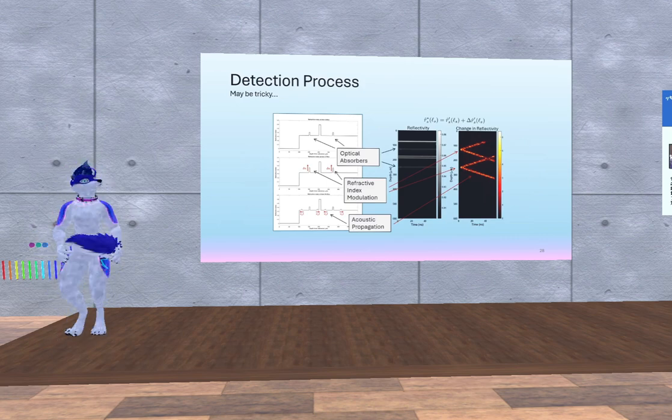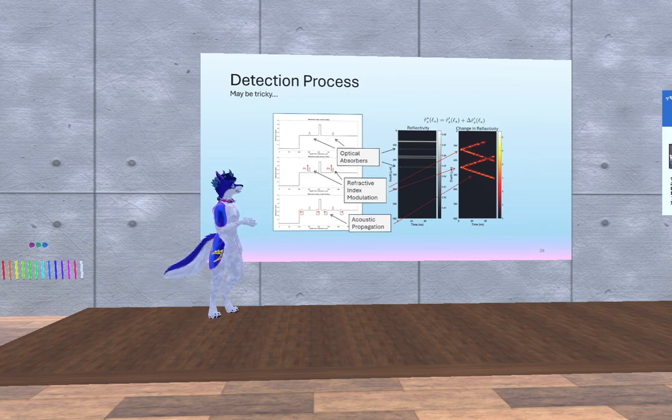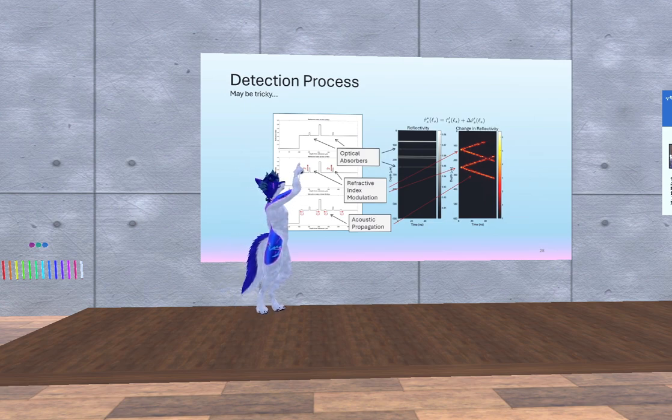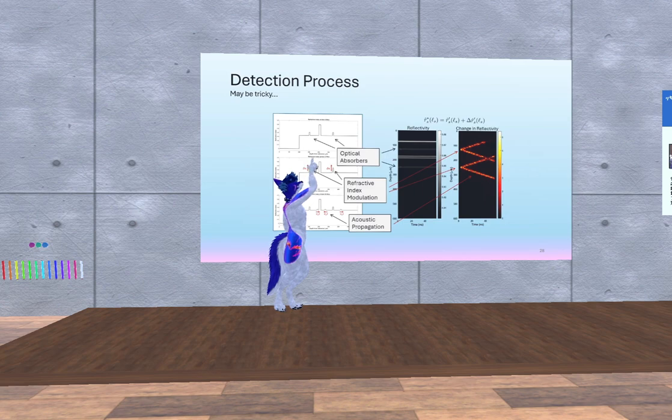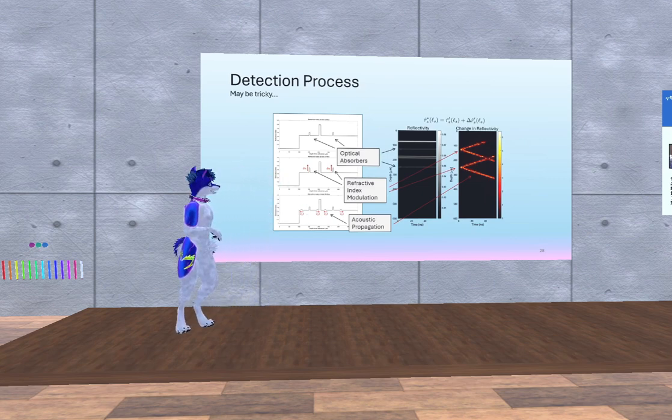Okay, so how does this work? We're going to move over to simulation space here. This is the hat we're going to pretty much wear for the rest of the talk. Let's build a little structure. Here's a profile in depth, and we have a couple of structures in here. Let's say we have some optical absorbers, these 2 small ones. Let's say we have a top interface, like air, water. We have an absorber here, an absorber here. They also have a refractive index profile.